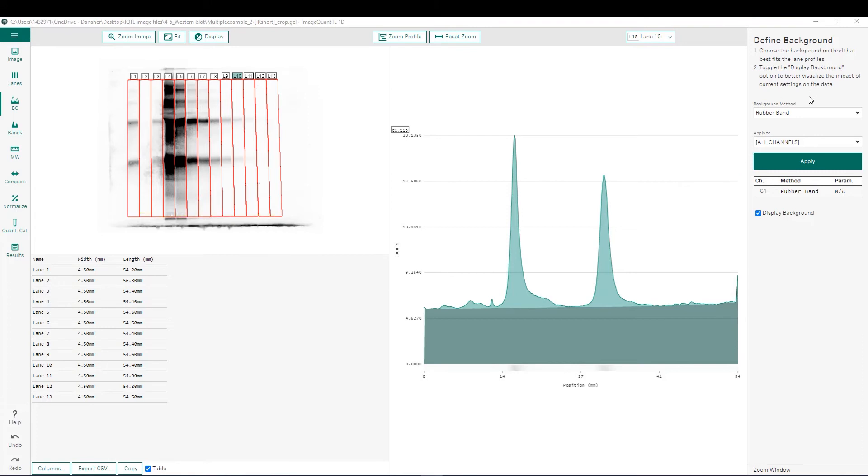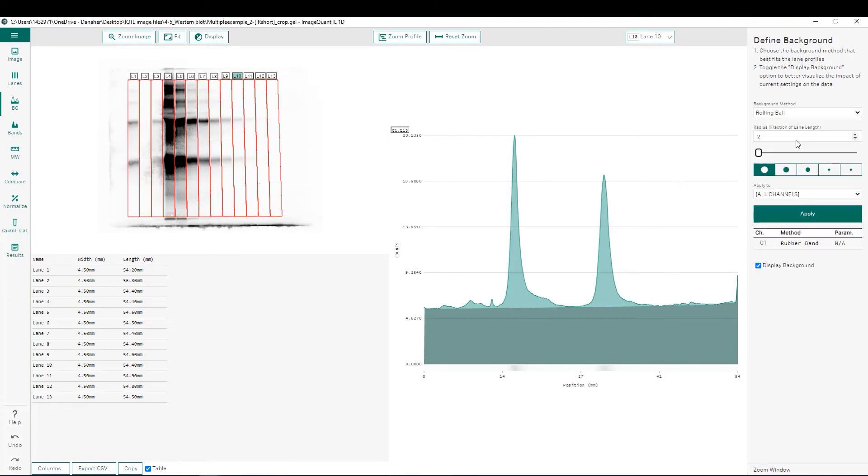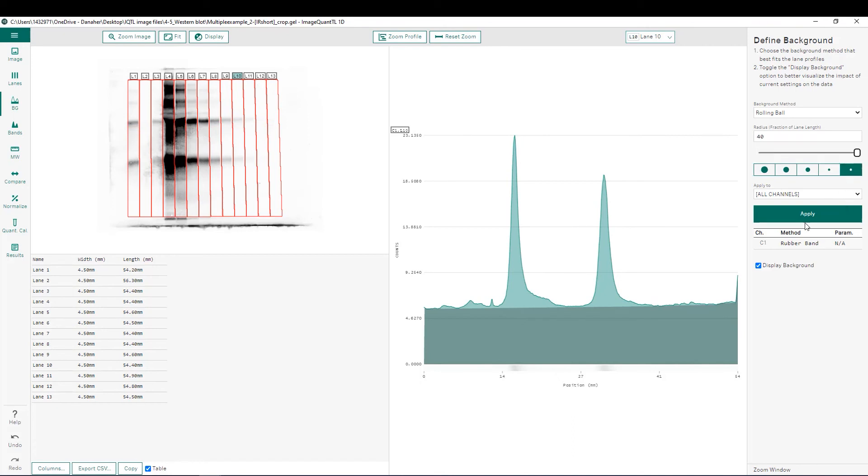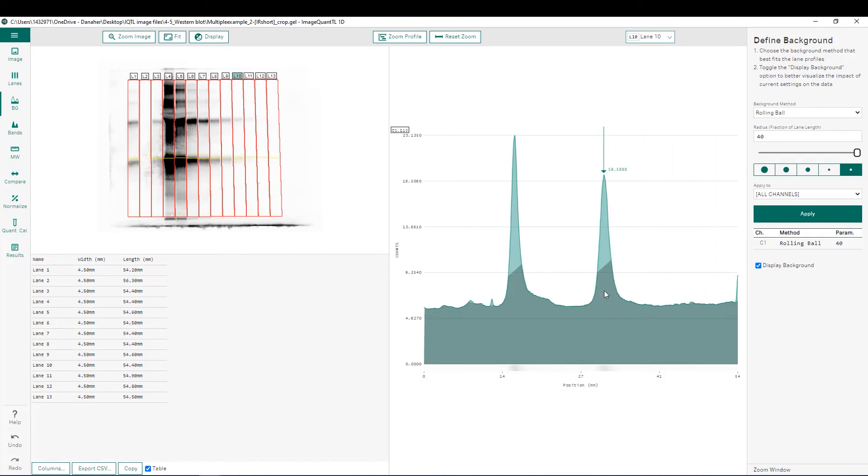The final and most commonly used background subtraction method we're going to look at is rolling ball. You can picture rolling ball working by taking a ball and rolling across the bottom of our intensity profile. The size of that ball is going to determine how far it goes into each one of our peaks. So for example, a very small ball is going to go much further into each one of those peaks. You can picture this as not a very effective background subtraction because we have all this area underneath the curve that is not being quantitated.